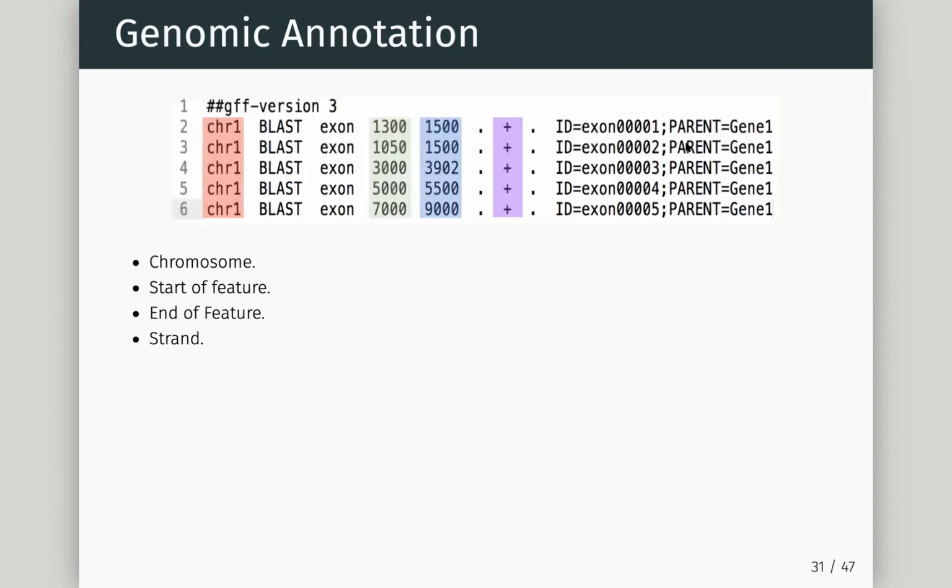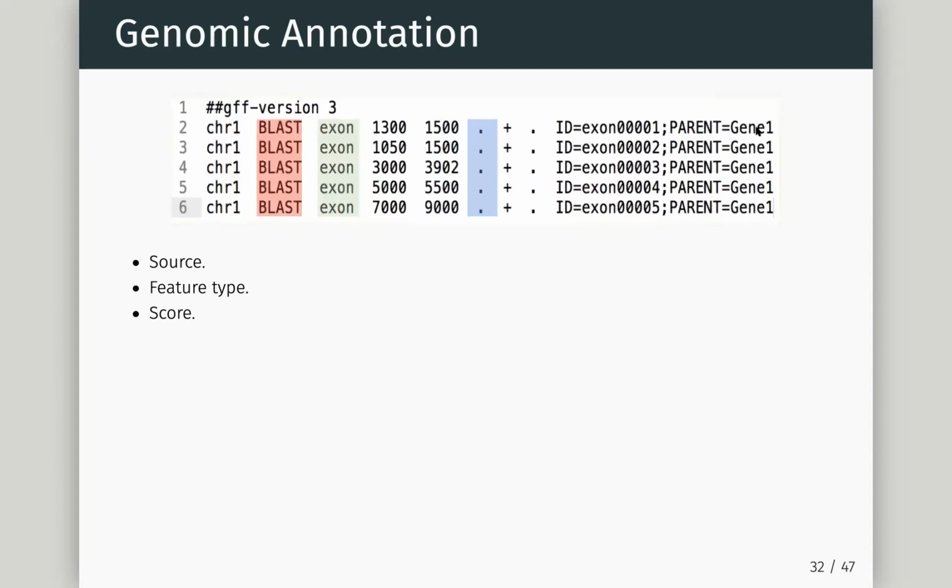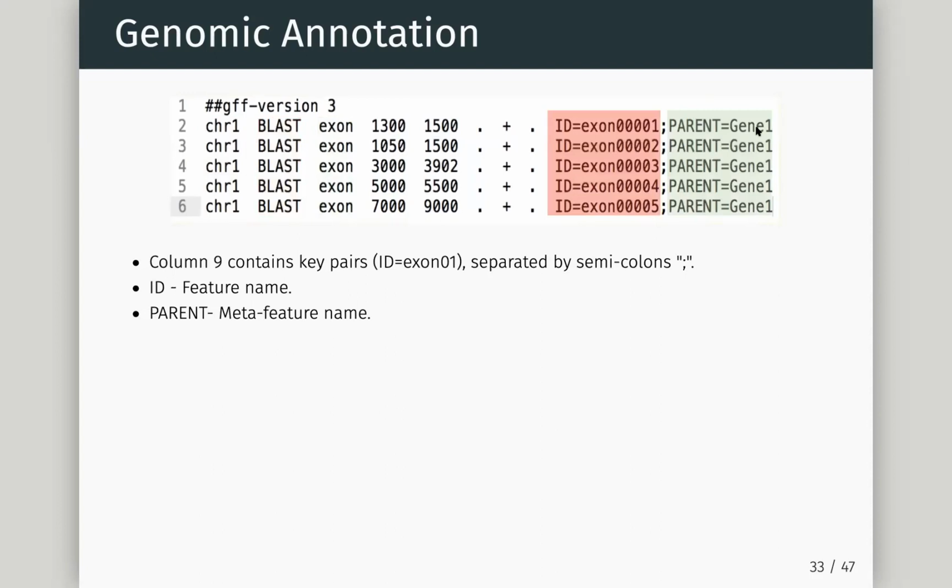But what's really important about this, oh, I jumped ahead a bit there. What's really important about this GFF format, what it has, which allows it to be so useful later on, is it has this concept of a feature, which is the individual line, but also a meta feature. Right? So this exon is part of this gene. So you can imagine later on, when we need to start to do summarization, give me all the reads which land on this gene. We then want to summarize very quickly over all the exons which make up this gene. Right? When we want to visualize maybe the gene model, as we will do in IGV later on, we want to see how this gene is made. It's going to piece together the exons for the gene using this information. So GFF, GTF format is what allows us to associate lines, these features, to meta features, these combinations of lines, these groups of lines.